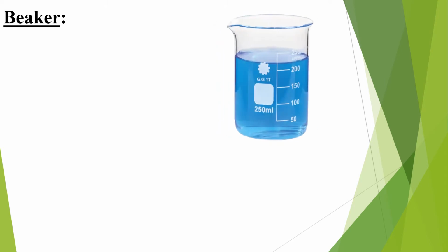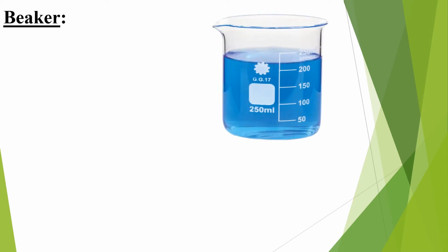So, firstly I will discuss about beaker. This is the structure of beaker. A beaker is a cylindrical glass or plastic vessel used for holding liquids.